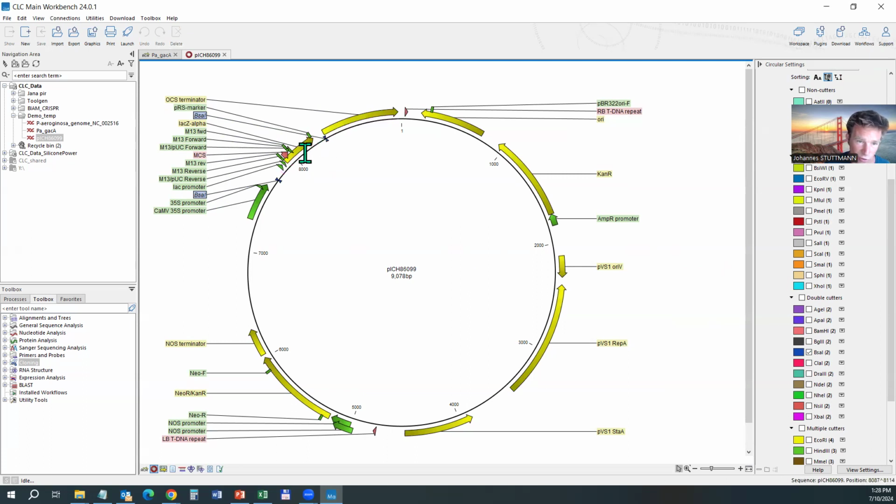So basically, if we replace this BsaI fragment with something that we want to clone into this plasmid, then this part will be eliminated and replaced by the gene, and the bacteria will grow out white on plates containing X-gal, while the original plasmid will grow out giving blue colonies. But what does our plasmid actually do? This is a plasmid for Agrobacterium, so for plant expression.